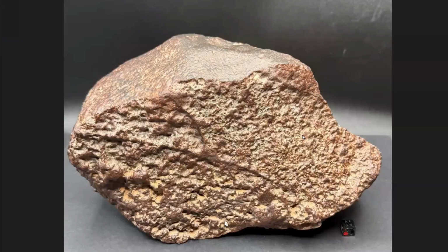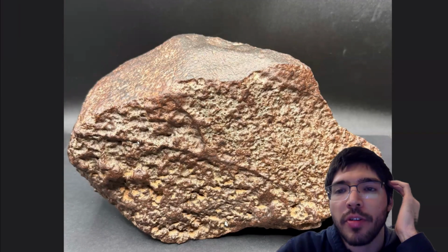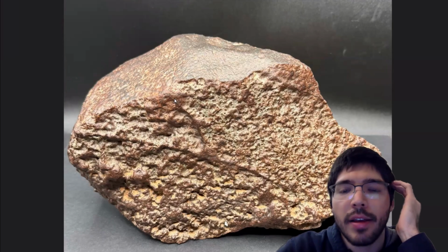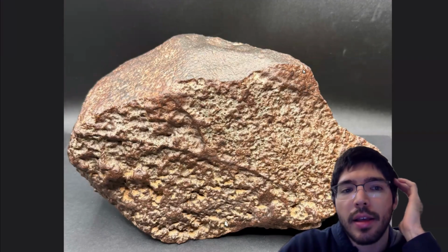So in the physical description, we're just describing that stone itself. For example, you can say it's partially crusted. You could say that there are parts of it that show a sharp break that likely indicated this was some part of a fragment of something much larger. All of this is referencing that particular stone. So we're just describing.